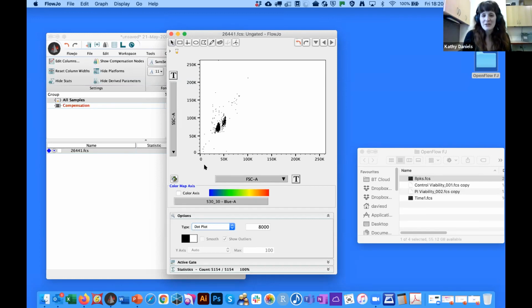I think this is a good time, as you're showing these different tools in FlowJo, to bring up a question that one of our attendees has asked. Krivono has asked, how common or uncommon is it to use BD FACSDiva for analysis as well? So we're focusing today on FlowJo for analysis, but yes, I probably should have mentioned at the beginning that you can do your analysis on the machine that you've acquired your data on.